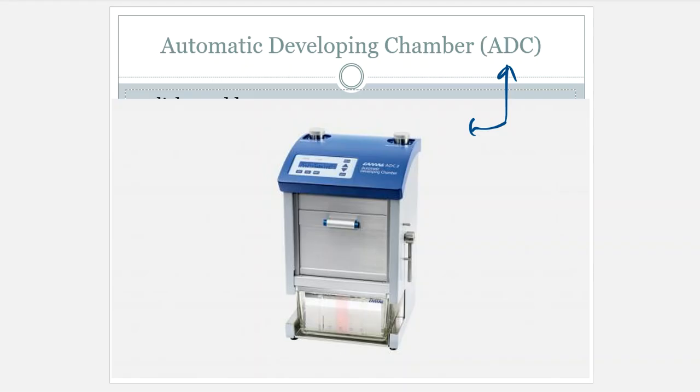All right, so this is our developing chamber that we will begin using on our HPTLC instrumentation that we have in-house. So what happens here, up here at the very top, is an area that's got a couple of components on the inside. There's actually a dryer that's built on the inside of this instrument, and it will pre-dry the plates for you. So as you spray and apply your samples onto the plate, it's going to make sure it gets like a 5-minute drill with a hair dryer, some warm air, just to make sure that all of those solvents are in fact driven off of the plate.